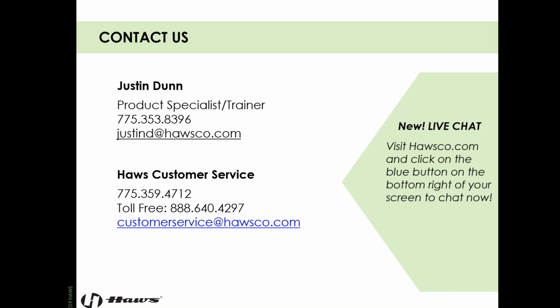Okay. And then I'll just touch on a couple more because we still have a good number of people on the call, but is there a guideline on time needed to flush the eyes? Example, 5 minutes for non-irritants or mild irritants, 15 to 20 minutes for moderate to severe irritants and chemicals that cause acute toxicity if absorbed through the skin. And it goes on, 30 minutes for most corrosives and 60 minutes. So can you just talk about basically the flushing time requirements?